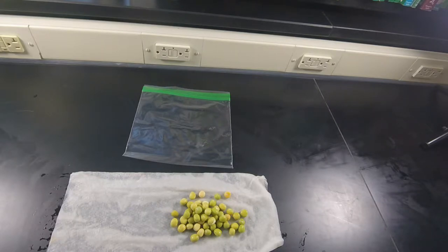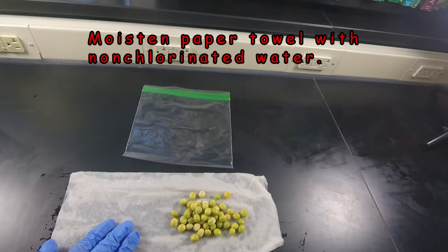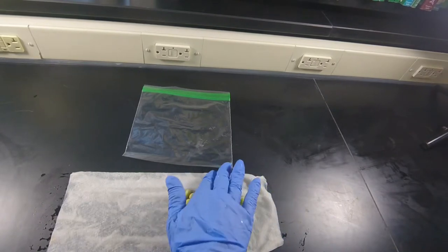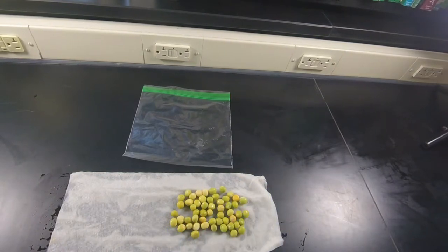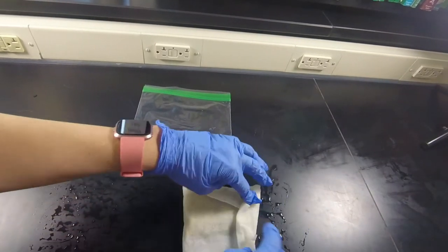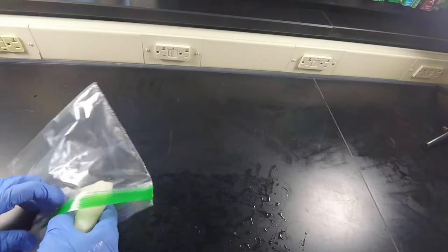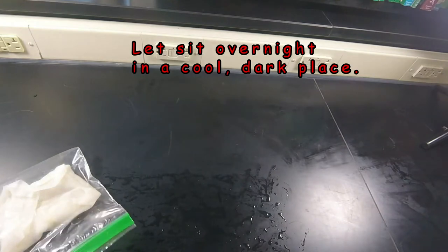After the peas have sat out all night, you want to place your peas on a wet paper towel that has been moistened with the non-chlorinated water. You want to make sure that all of your peas are in contact with the paper towel, so none of the peas are on top of each other. Place the peas on 1/2 of the paper towel, as shown here, and then fold the paper towel over to make a container for the peas. Then place the wet paper towel containing your peas into a plastic sandwich bag and leave them overnight in a cool, dark place.